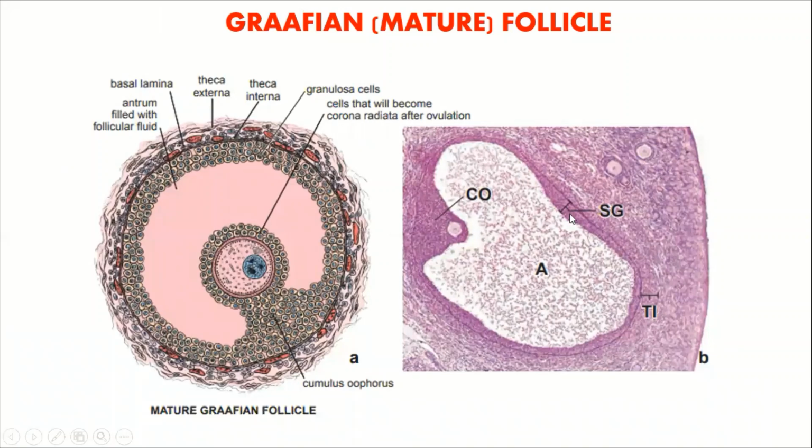We can see now the stratum granulosum has thinned out here. A single follicle, a single antral cavity, a large follicle.